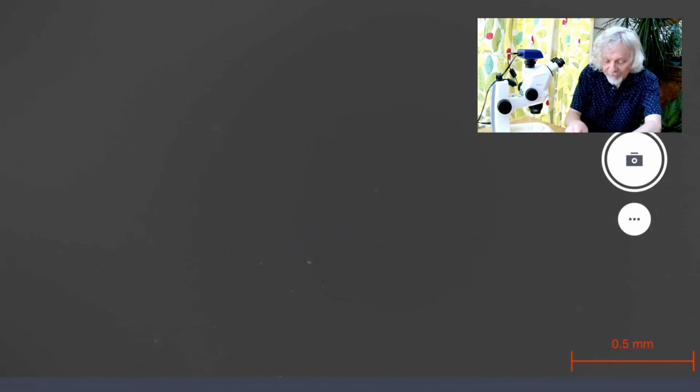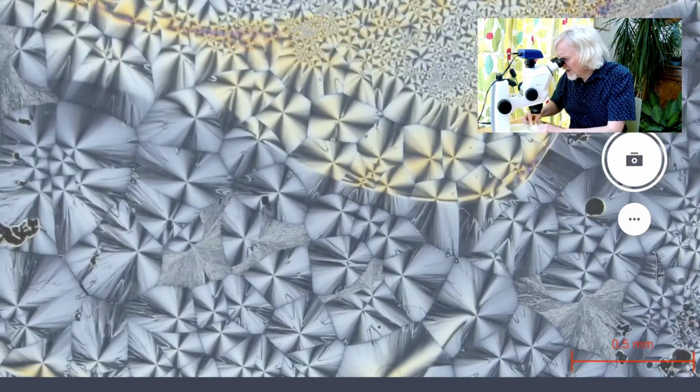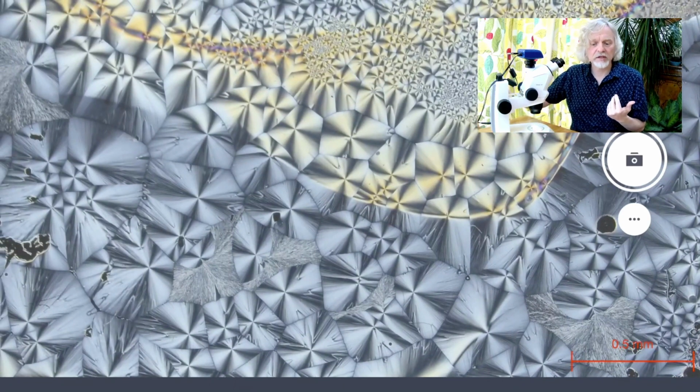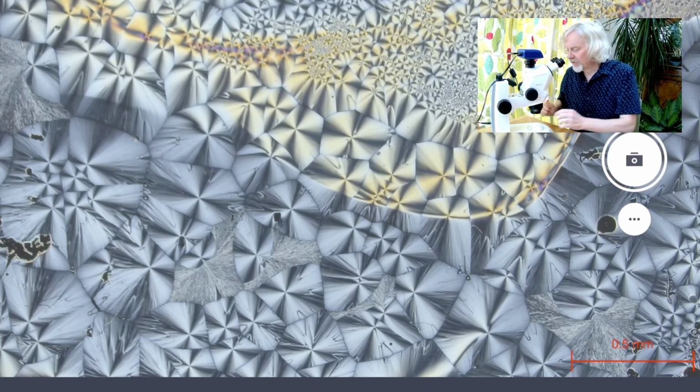You can crystallize different things. Here's a different type of crystal. This one is aspirin in ethanol. Aspirin dissolves actually quite well in ethanol. So this one works quite well. And here it is. Look at that. And it creates a completely different type of crystal. It's not quite so colourful, but it's still quite good fun. You get these sort of little rosettes forming instead.